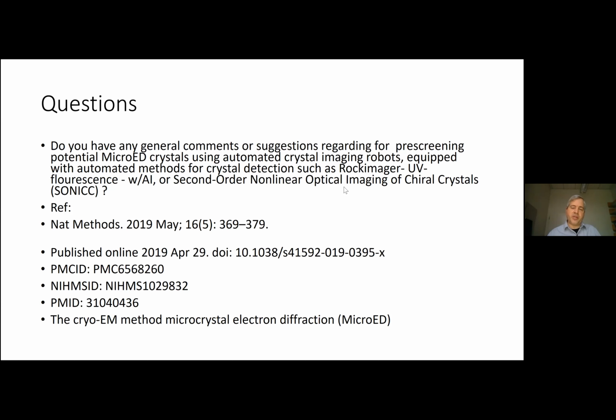So you do need as much sample in terms of concentration as when you make proteins for crystallography. Now, you're only going to be using a tiny little bit of it to put on a grid, 2 or 3 microliters. So it's possible you could make the drops smaller, or you could perhaps use the screening robots where they make really, really tiny drops, and take advantage of the fact that you don't need a big volume. But I think you do need the same high concentration because you need to crystallize the protein.